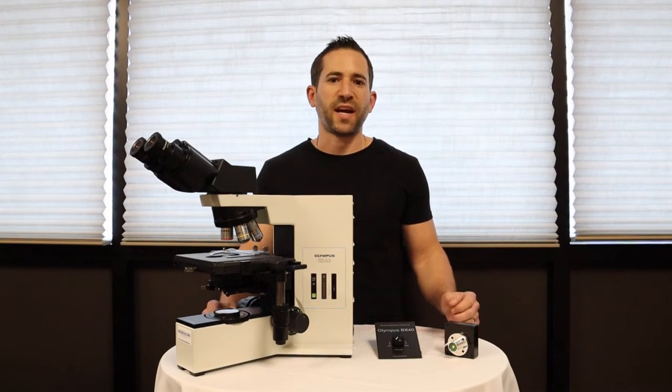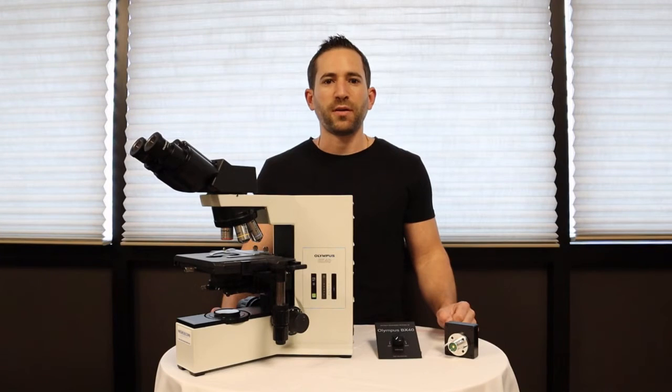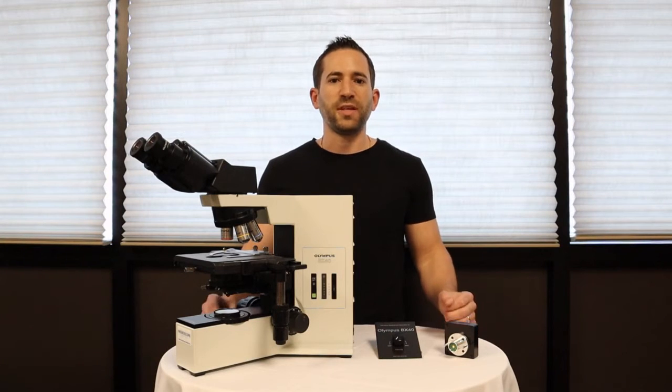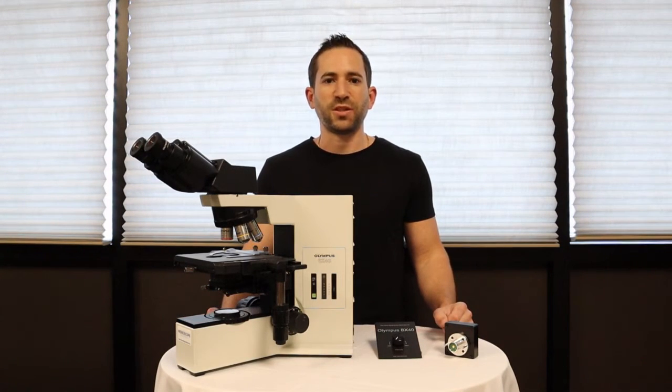The Olympus BX40 is a fantastic microscope — it's built to last and high quality — but there's one problem: over time the electronics fail, and this model is no longer supported by the manufacturer Olympus, leaving you to replace your microscope or upgrade it to LED illumination. There are many solutions on the market, but I'm going to show you a high-quality solution.